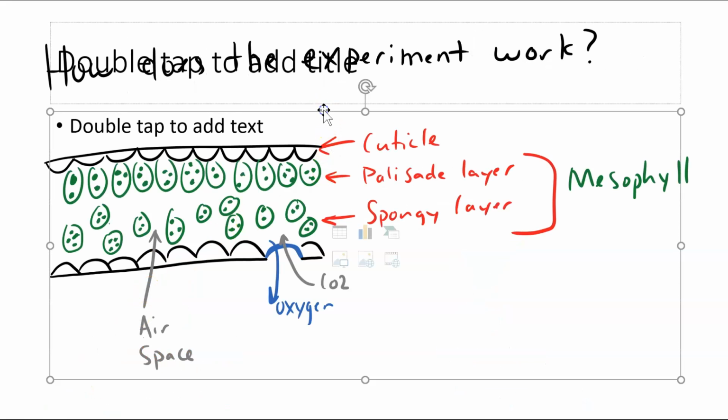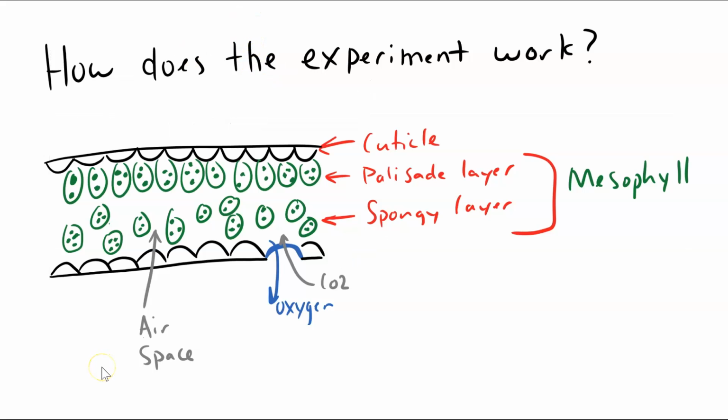So how does this experiment work? Well, you have to recall a little bit of the anatomy of the leaf to see what's going on and how we take advantage of photosynthesis to create this experimental setup. So recall, if you take a cross-section of a leaf, the green portion that makes up the majority of the center of the leaf is the mesophyll layer. The mesophyll layer is full of mesophyll cells that have lots of chloroplasts, and the chloroplasts have lots of thylakoids that perform photosynthesis. So we have taken all of the air out of the leaf discs by degassing them.